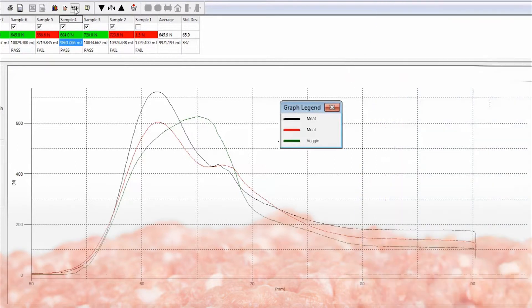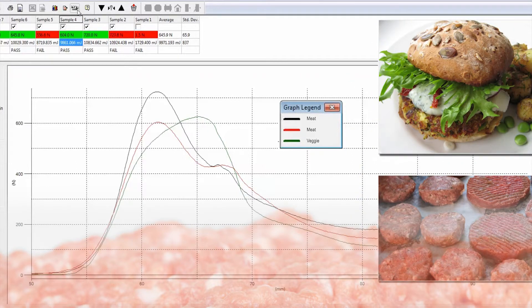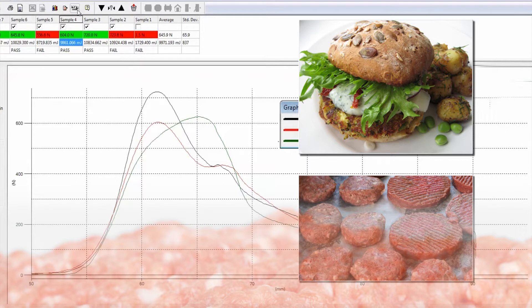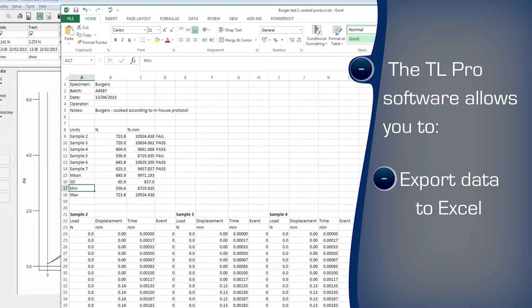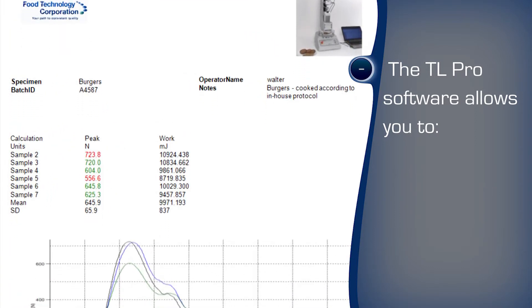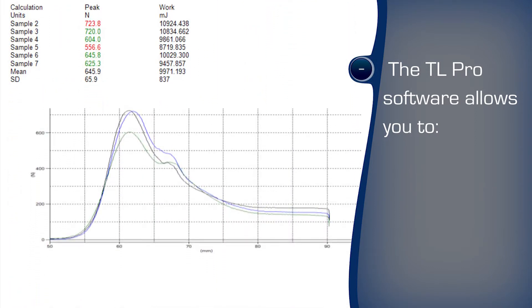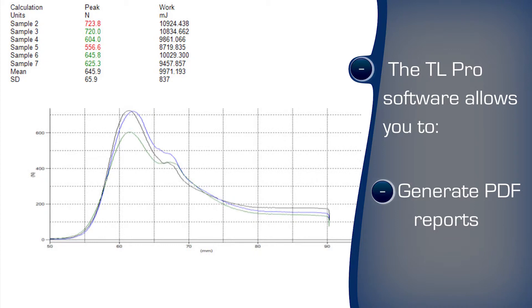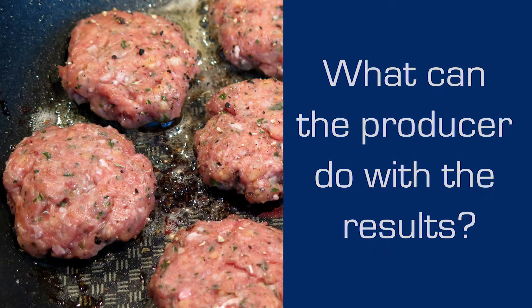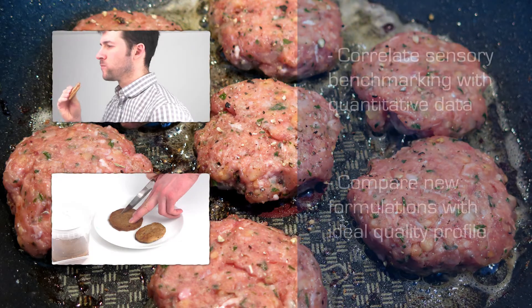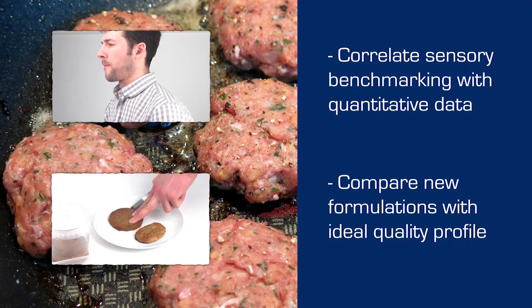Pass and fail criteria may be used to highlight overly tough or soft product. The burger should be firm enough to retain its shape during cooking and handling. The TL software can export to Excel for further examination and traceability, and format the results in a user-customisable report style. Analysis of the measured data brings understanding to the effect of variables in the food supply chain and therefore the ability to optimise quality.